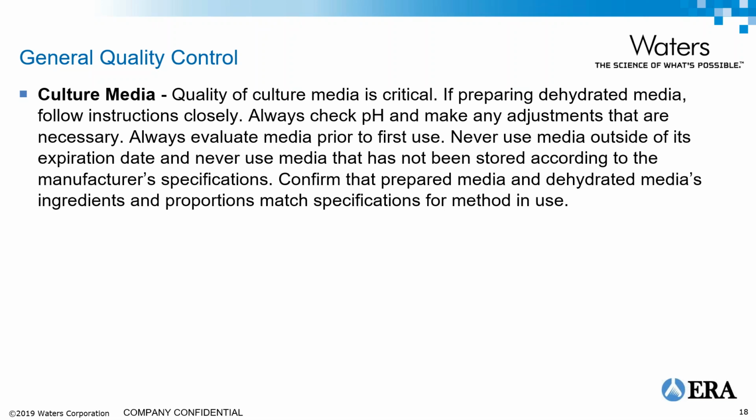Never use the media outside of an expiration date. If you've somehow managed to store it in a way that was not recommended by the manufacturer, don't use the media. Their expiration dates, all of that information is based on you following the instructions.